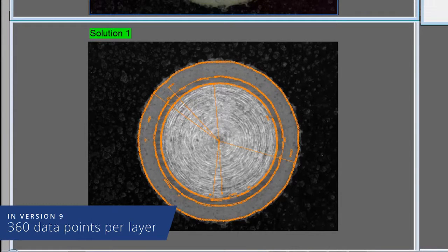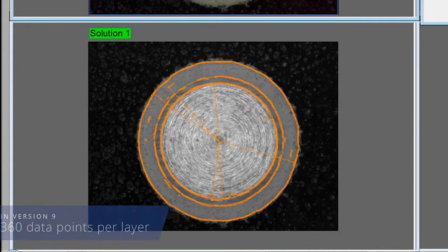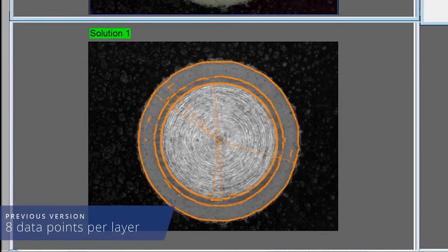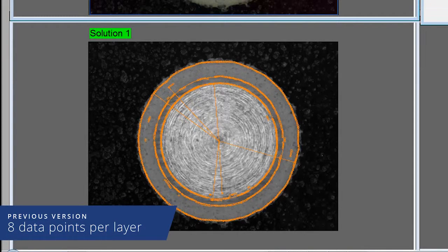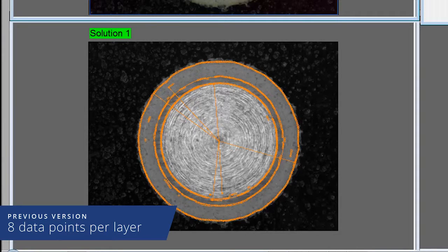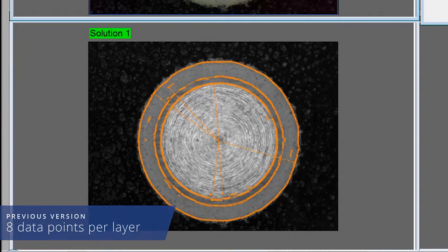Whereas in the previous version, the manual process would require the operator to add up to 8 data points per layer, making the process much less accurate. And since it was up to personal interpretation to define the thickness of the independent layers, this led to variability in measurements between operators.